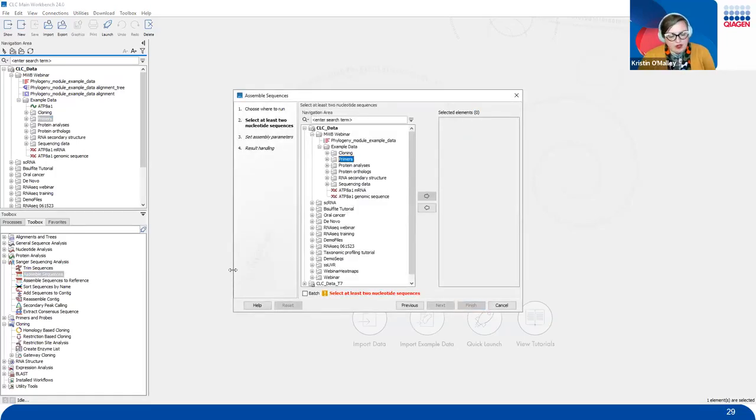And if you come across any parameters that you are confused about, please feel free to utilize this help button. There is a wealth of nitty-gritty information about any and all of those parameters that you can tweak and mess around with in all of these tools. So again, that help button is going to be your best friend when it comes to stuff like that.